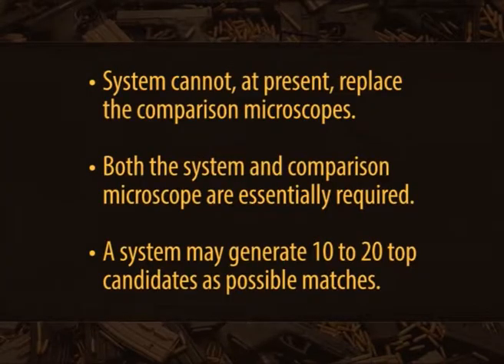The following important points are worth mentioning. The first point is the system cannot at present replace the comparison microscopes. Both the system and comparison microscope are essentially required.